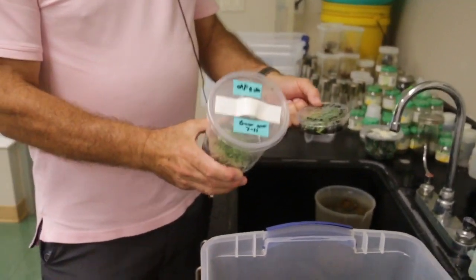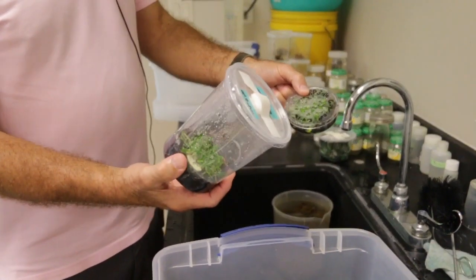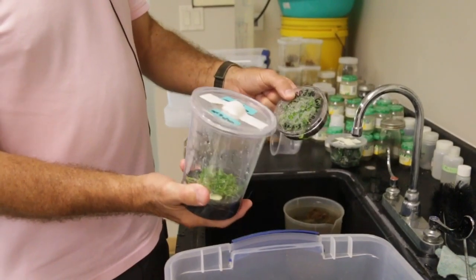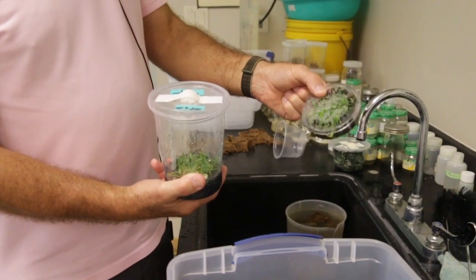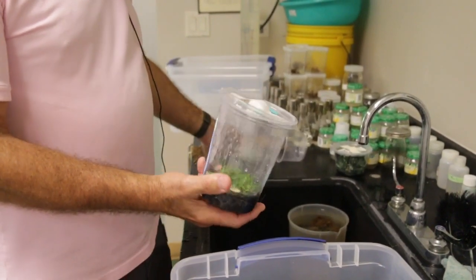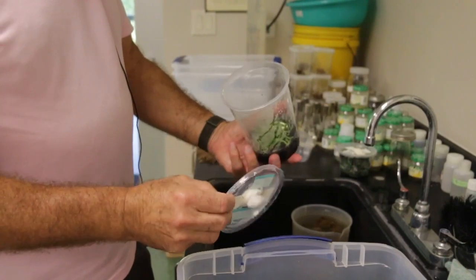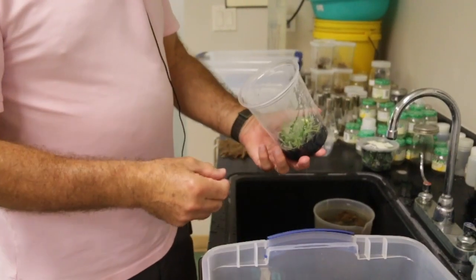What I did last week is I dragged the contents of this out and put them in here, but there was a contamination in here that I didn't see, so that contamination has grown out on a new plate. This one I was going to put in a new flask, and I opened this up, and then I could see the contamination that was on the outside of this dish. So these are growing really quickly. And this contaminant that's in this flask hasn't really done any damage yet, so I can pull this out and clean off the roots. And then we'll see how they go.